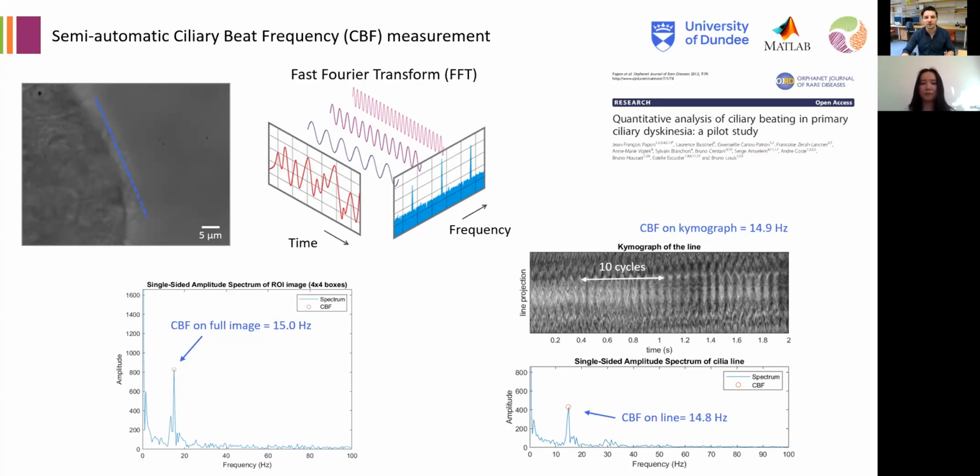So any kind of video, even with a smaller magnification than you would expect for getting actual ciliary beat pattern parameters, would let you get the ciliary beat frequency. Once again, both ERS and ETS agreed this is not the main parameter, and it can't be taken alone as a diagnosis.